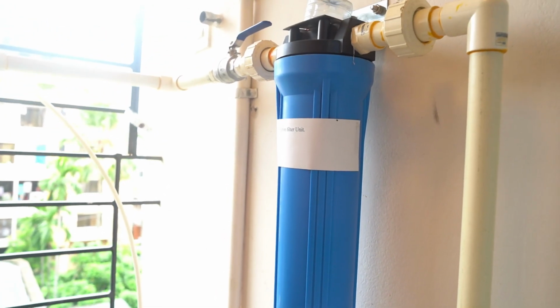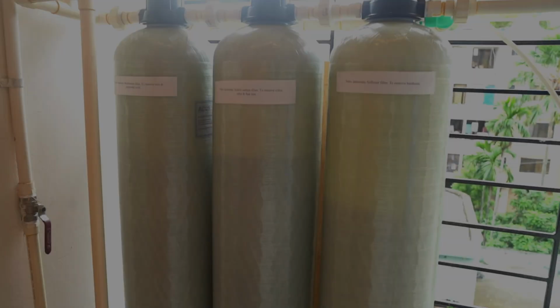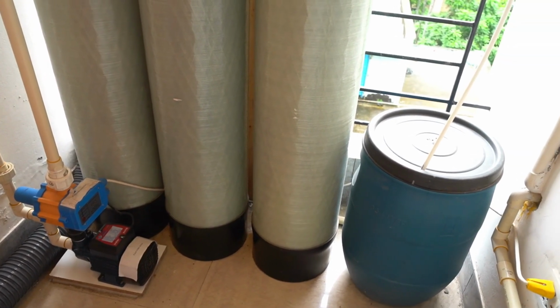Grade 3 water is a quality water that meets standards laid out by British or international standards. It is a transparent, tasteless, odorless, and nearly colorless chemical substance. This water is intended for laboratory use only.